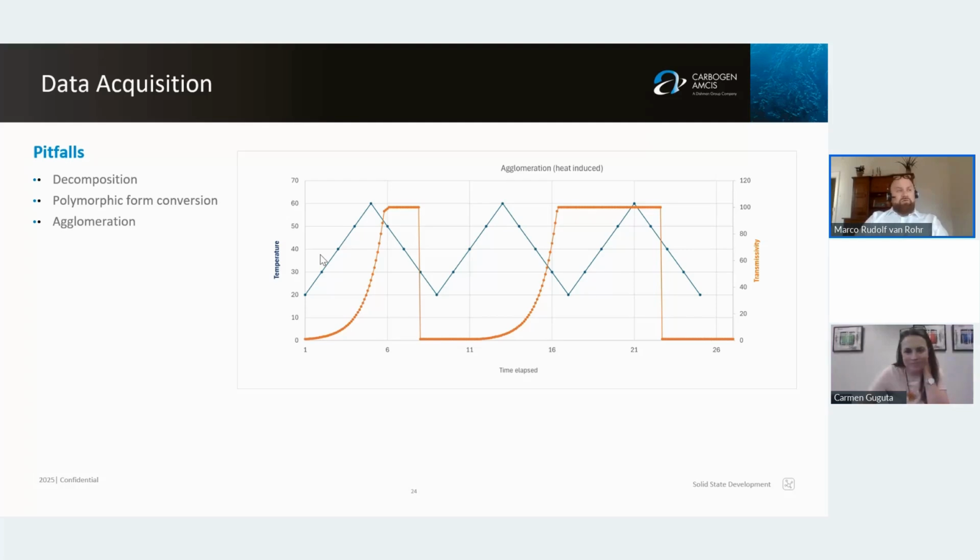With anti-solvents, I think toxicity is really important when it comes to late stage. So water is always good if you have alcohol and water systems. Heptane can be good, but it has to be handled with caution. Toluene can be good, but has to be controlled. I like low boilers, but it's often a gut feeling.